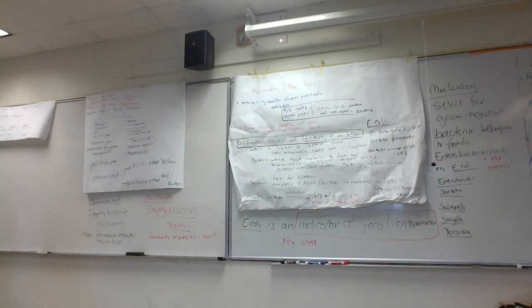Okay, all right. So folks, what we'll do, I'll leave the MSA plates up here for you to take a peek at, sort of in line with our mannitol salt concept. Yeah, yes. No, it's awesome.